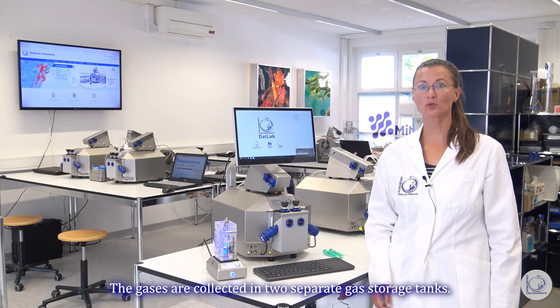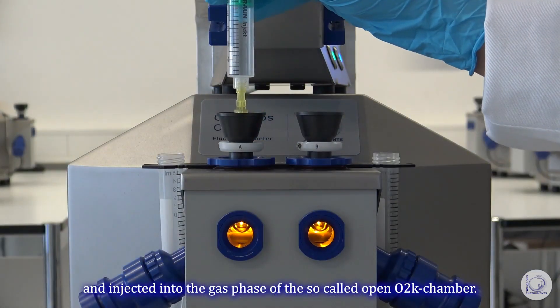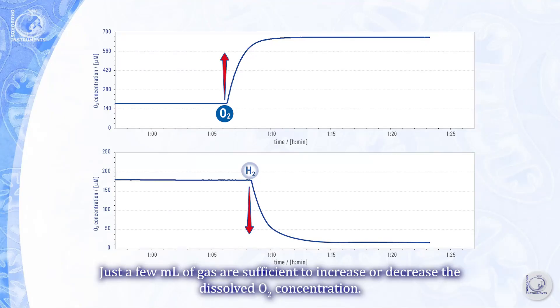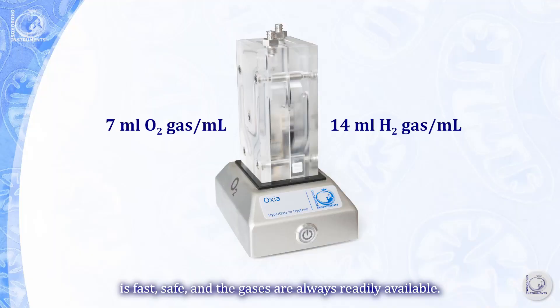The gases are collected in two separate gas storage tanks. Using a syringe, the gas is withdrawn and injected into the gas phase of the so-called open O2K chamber. Just a few milliliters of gas are sufficient to increase or decrease the dissolved oxygen concentration. Production of oxygen and hydrogen gas by Oxia is fast and safe, and the gases are always readily available.